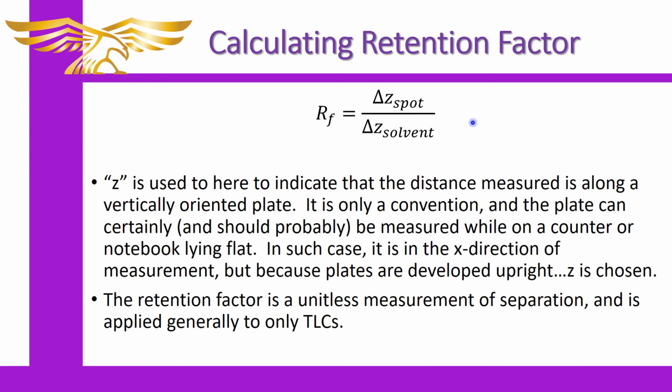For most of you, you will not be able to measure the retention factor with any greater significance than that of about 2 significant figures, because most rulers have centimeter markings, but those markings are only resolved to about 1 millimeter each. So you really can't get more than 1/10 of a centimeter in resolution from any of these methods.